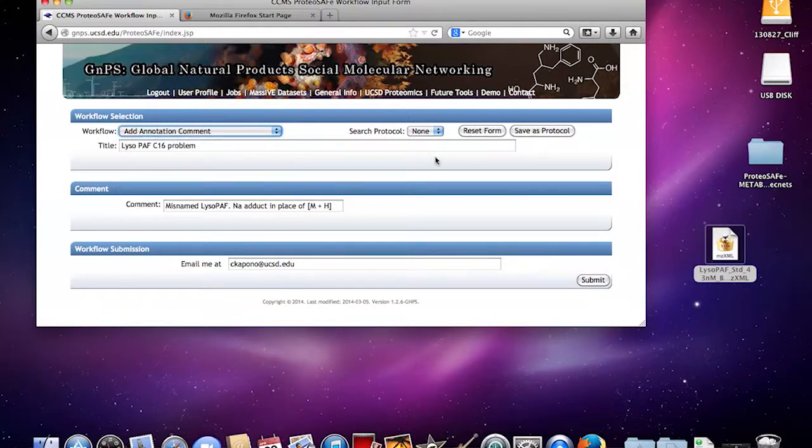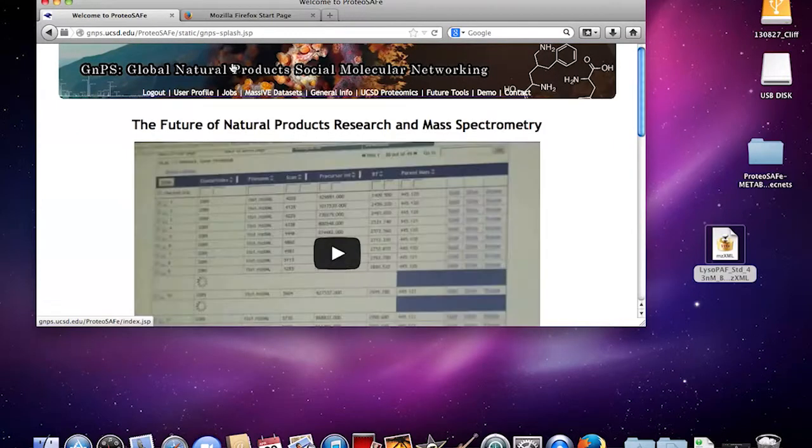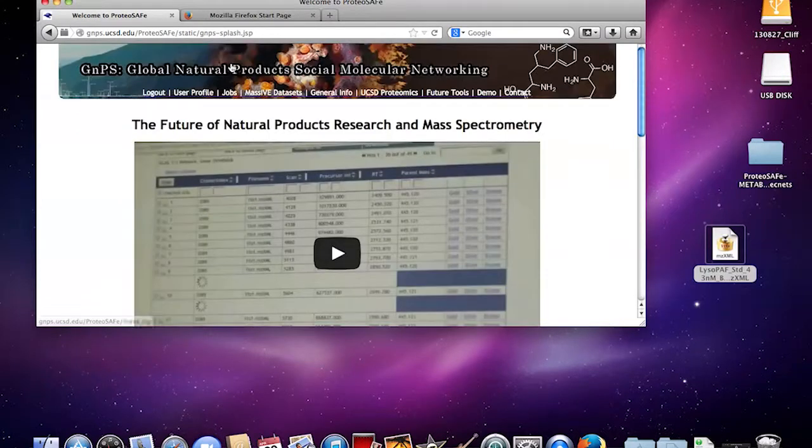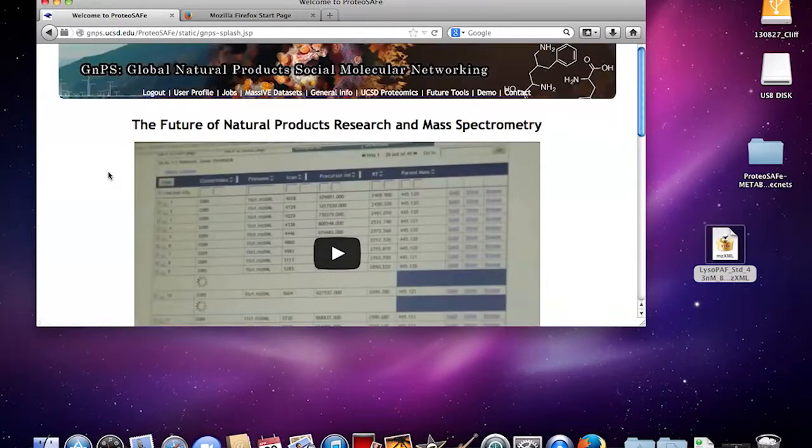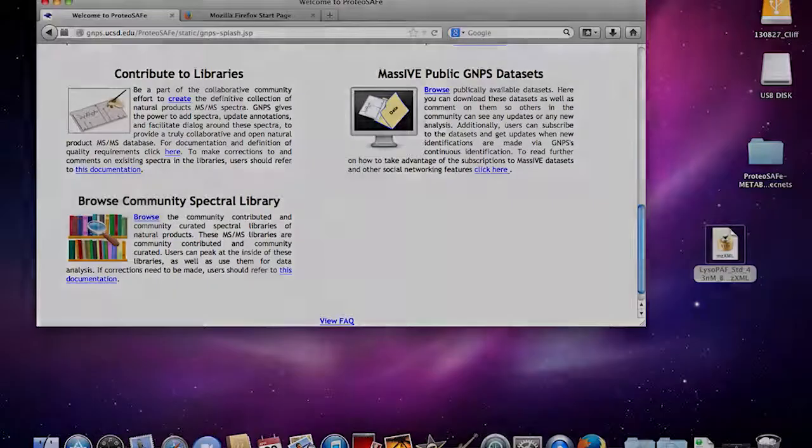Alright, so that's basically how to upload data sets to the GNPS library. Mahalo.